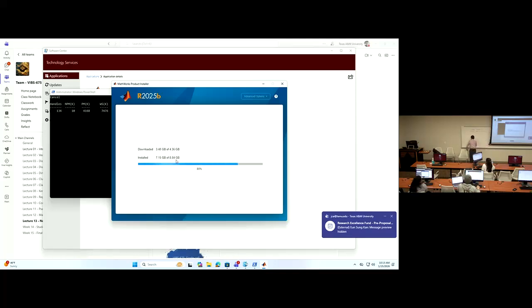So today we are going to do this MATLAB 101 first, so you get familiar with the interface and what you can do, very basic. Then we will jump to the 10x Genomics cloud. In this place, you will learn how to run Cell Ranger. Cell Ranger is an essential tool once you have the FastQ files. You put them into Cell Ranger, and Cell Ranger gives you the expression matrix.